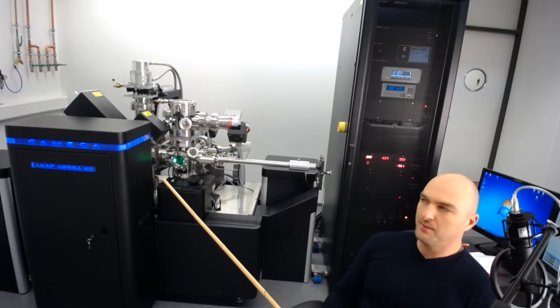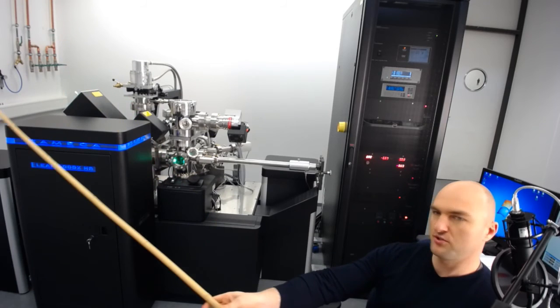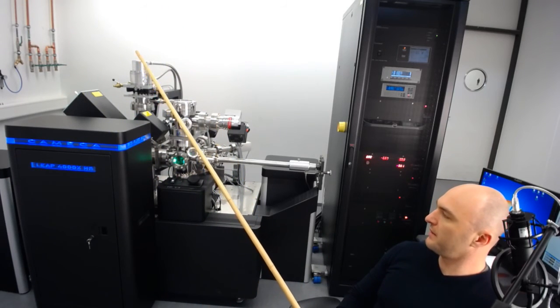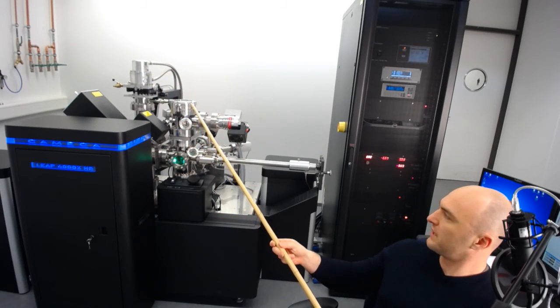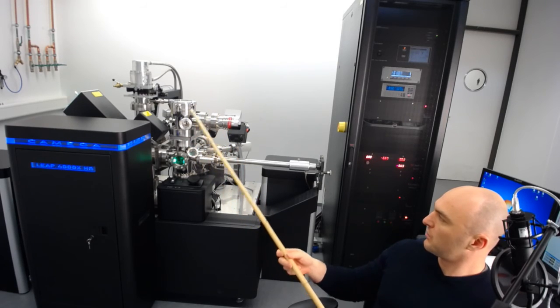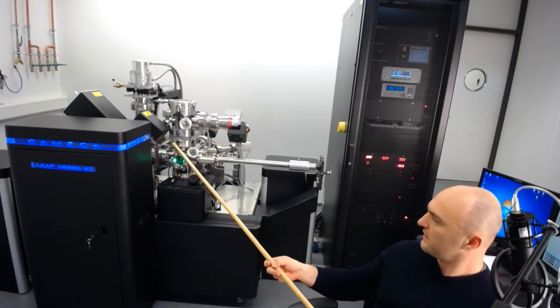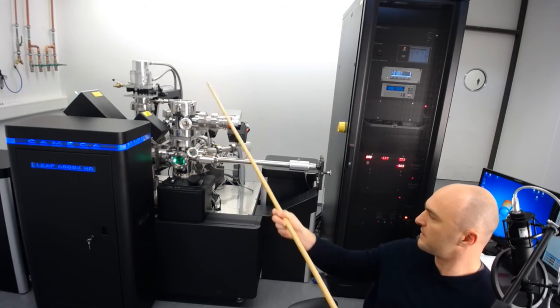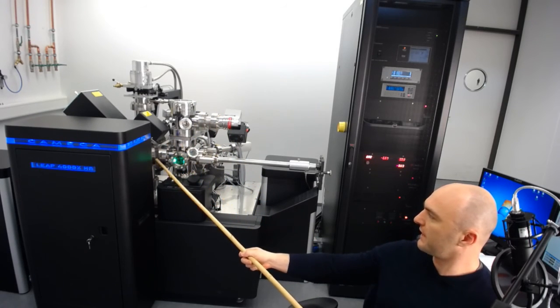Again, this is a LEAP 4000 XHR model, which means we have a laser unit — which is off-camera right now. We've got the load lock here, and I'm going to vent the load lock in a moment so you can see what it looks like when we vent it. Then we've got the buffer chamber here, with some viewports so you can always see what's happening inside, and CF100 gate valves in between.